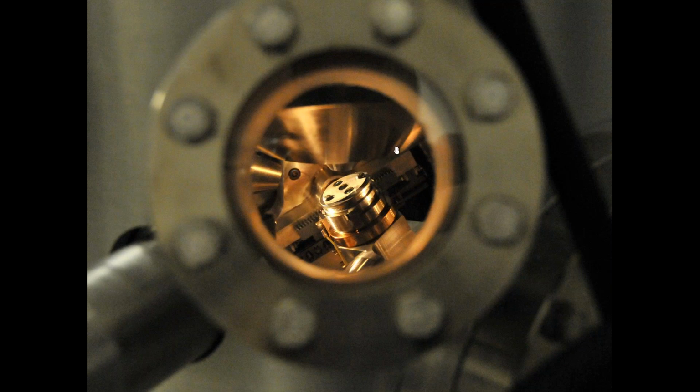The end of the CMA is this larger cone. This tilt angle enhances our detection of electron emission from the surface, which is strongest in the normal direction. So we tilt this sample towards one of the acceptance angles of the CMA. Off to the left, you can see the end of the ion gun.